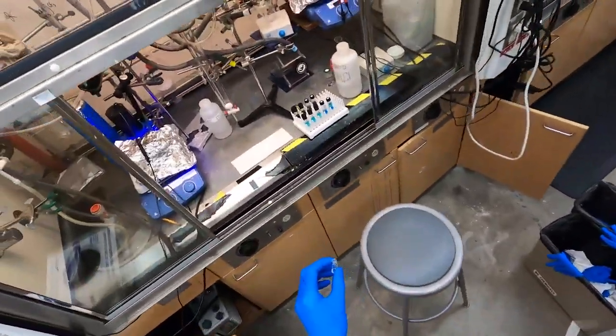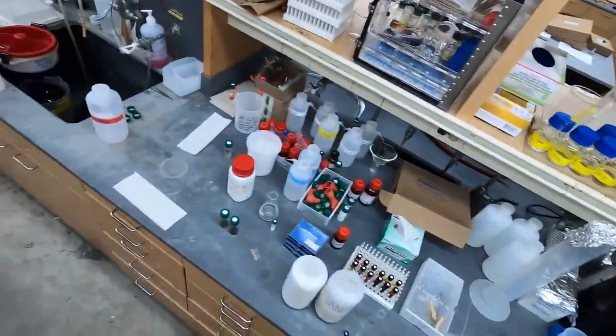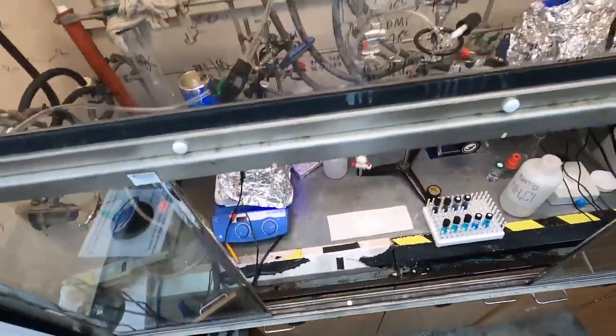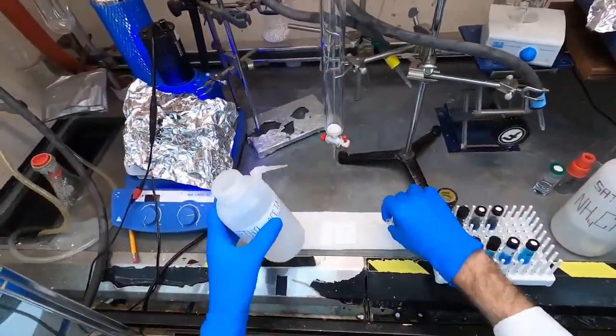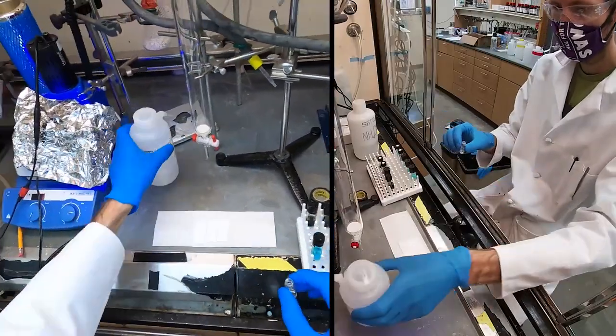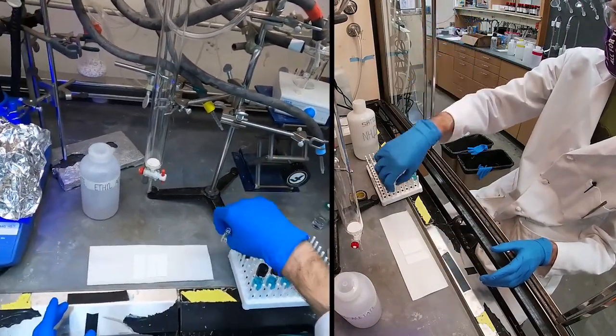And what we want to do here is make sure that in our column conditions the starting material does not overlap with our desired product on the TLC, so that when we go ahead and isolate this, we know we're going to get some clean separation.